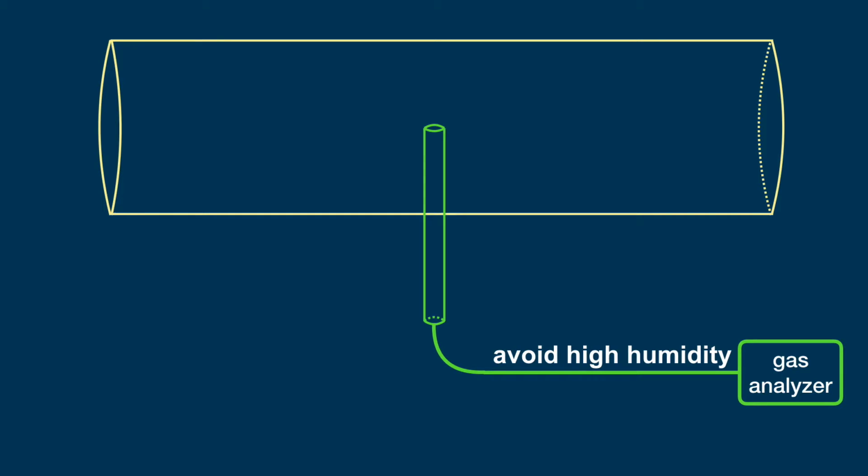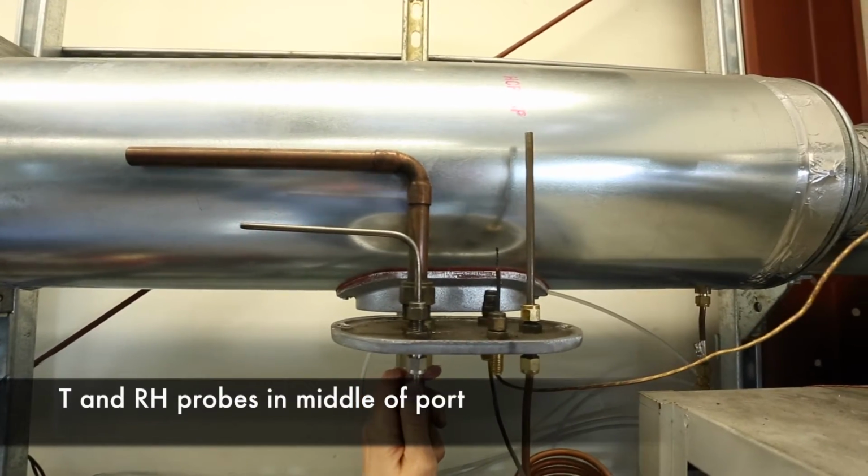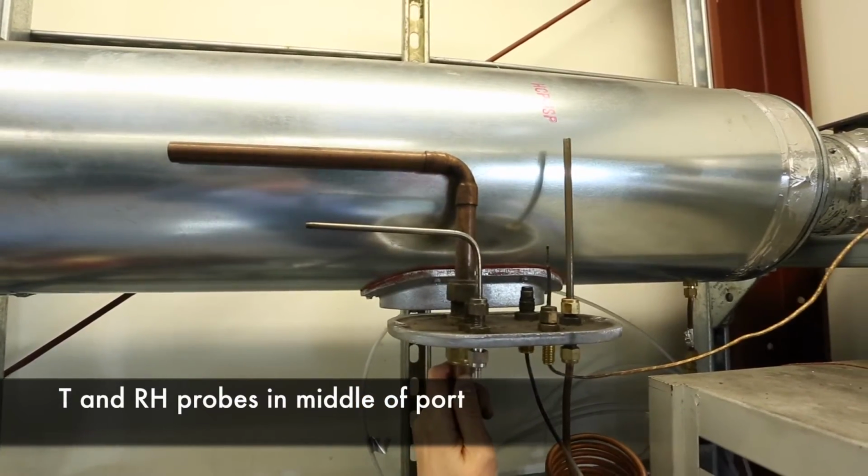Moisture and particles in the gas sampled from the duct can damage gas analyzers. To prevent condensation in the gas sample line, ensure that your gas sample remains significantly above the dew point temperature at all times. Follow your gas analyzer's recommendations. If no guidance is provided, we recommend that the relative humidity of the sample gas be less than 70% at room temperature. You can monitor the humidity and temperature in the duct using a thermocouple and a capacitive humidity sensor.